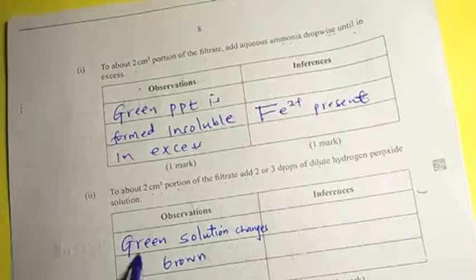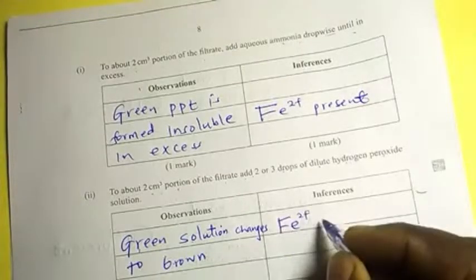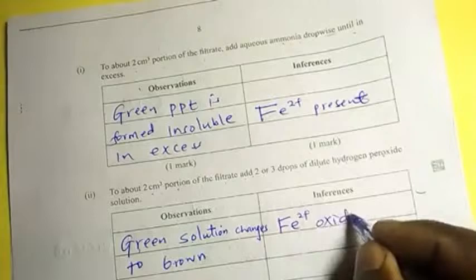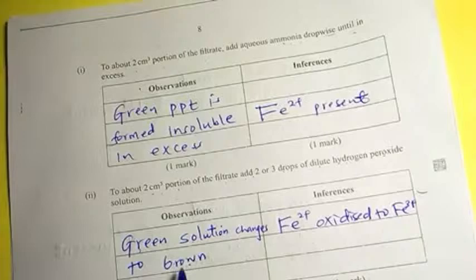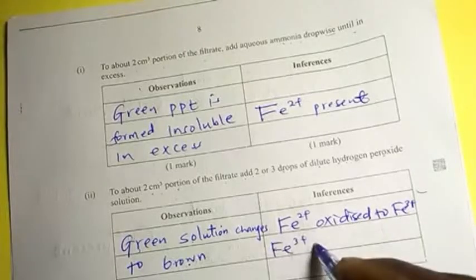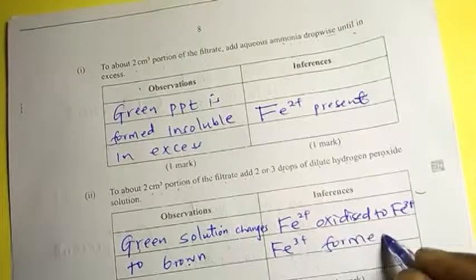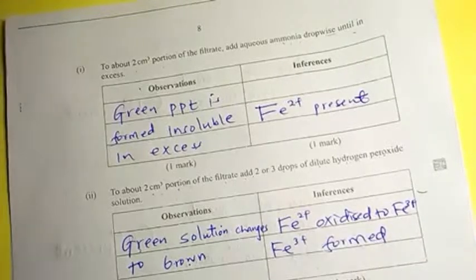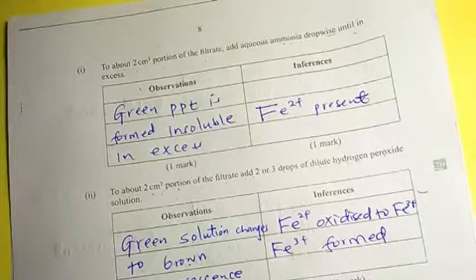That means iron 2 is oxidized to iron 3, because iron 3 is the one which is brown. So you can say iron 3 formed. And there you expect an effervescence. You don't have to put anything there.